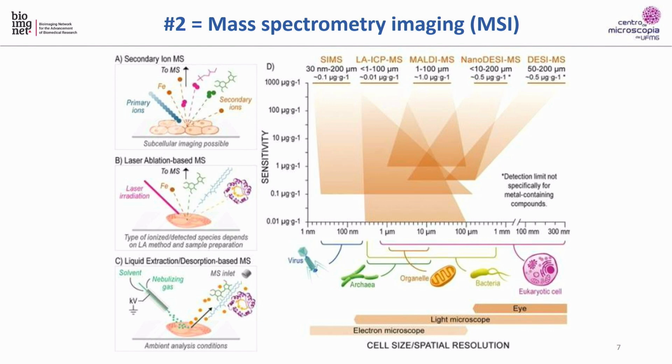Now with the newest systems that are coming, secondary ion mass spectrometry, I can't go into the way they do this, but for biology they now have new types of cluster beams that you can ablate with, and you can get peptides, lipids and carbohydrates fairly intact, at least up to 20,000 Daltons.